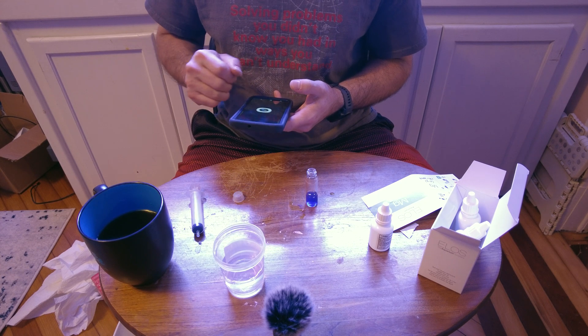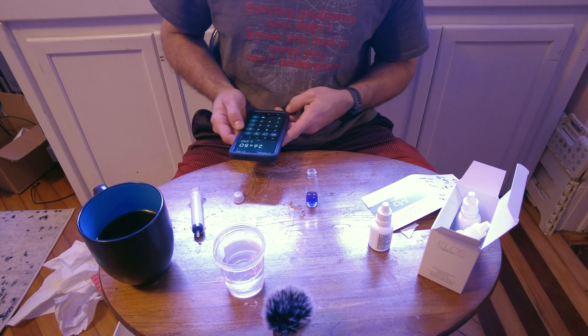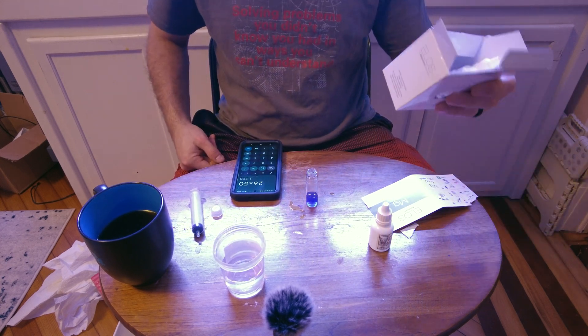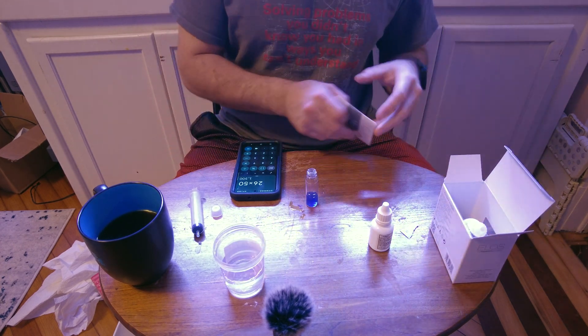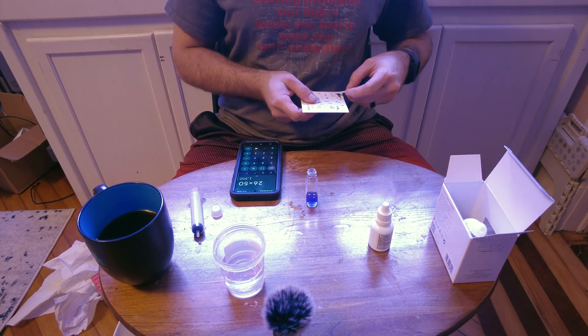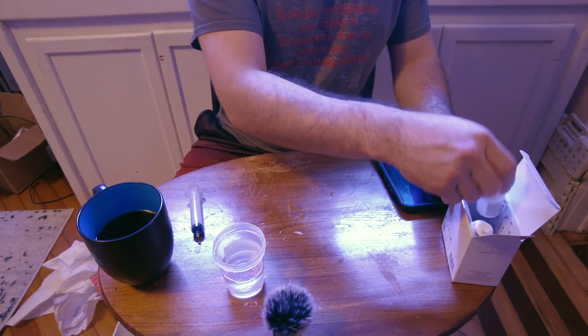31. So we've got 31 minus 5, which is 26, times 50 — I'm going to use a calculator. That gives us 1300 ppm of magnesium. The margin of error listed on the ELOS kit is 13 ppm, so we've got 1300 ppm ± 13 ppm from the ELOS kit.